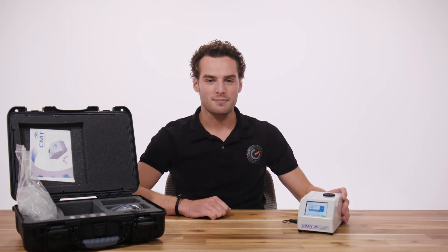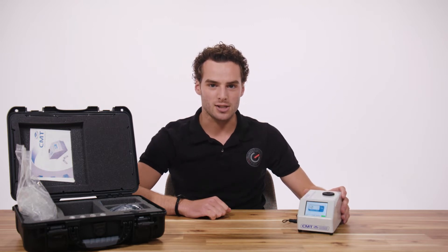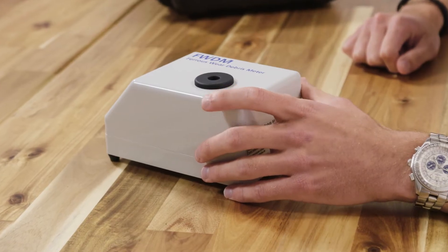CMT's Ferrous Wear Debris Meter, or also shortened as FWDM, is an easy to use but very sensitive instrument for detecting the amount of Ferrous Wear Debris in a lubrication or hydraulic fluid. Most of the time this will be iron, and that's why the FWDM meters are also known as iron and oil testers.